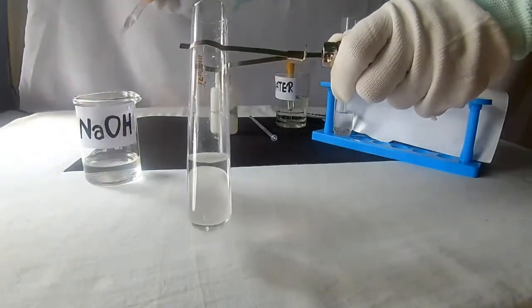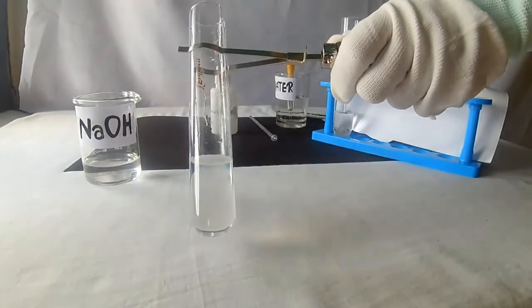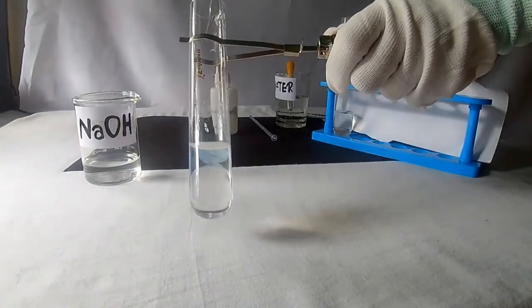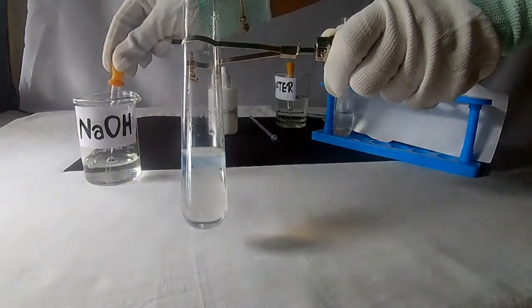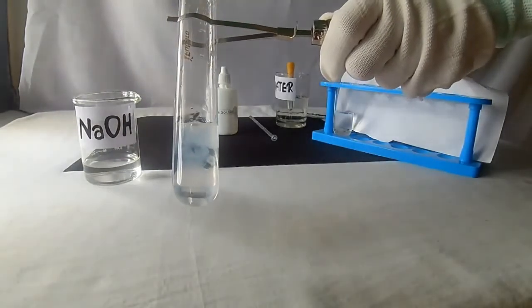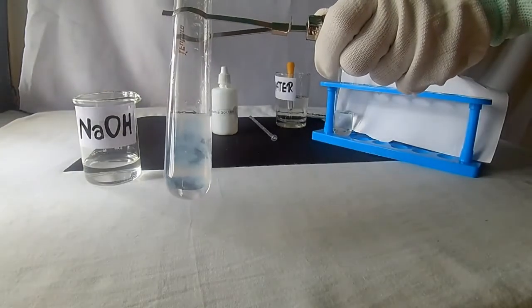First, add few drops of sodium hydroxide and observe carefully. We can see a white precipitate being formed. This is zinc hydroxide. It is called a gelatinous white precipitate.